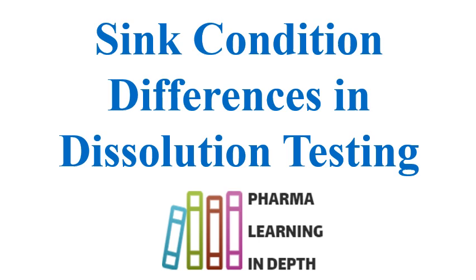Nowadays I come across dissolution methods with different SLS or surfactant concentrations for different strengths of the same formulation. For example, for 100 mg strength, the SLS concentration is 0.2% in water, and for half of that strength, 50 mg, the SLS concentration is half. I hope this video will help you to understand these terminologies and why there is faster dissolution for lower strength and slower dissolution for the higher strength.